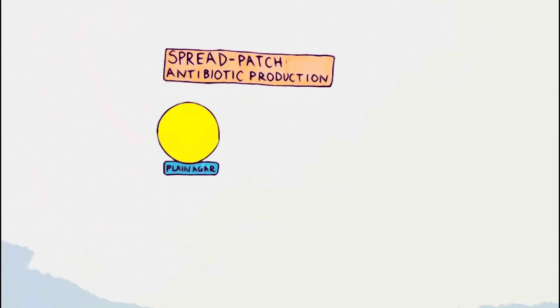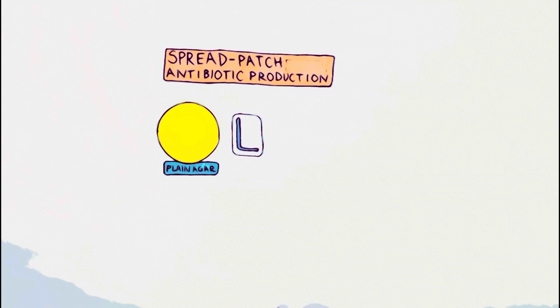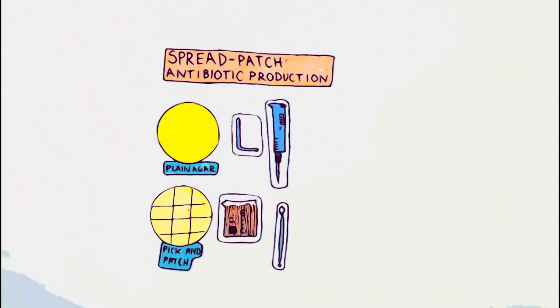The spread plate method is used first. You can do this one of two ways. First, by using the method used before with the sterile hockey stick and pipette. Or you can use a sterile swab to smear the pathogen all the way around the plate. Then, use the pick and patch method with the sterile toothpicks or loops to test all 12 isolates for antibiotic production. While this technique is simple, the implications are extraordinary.